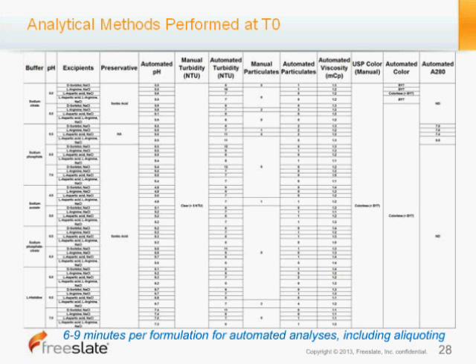So as you can see, if you look carefully through here, the pHs are more or less where we targeted them to be. Because we were using liquid compounding, some of the pHs varied a little bit more than normal manufacturing specifications.